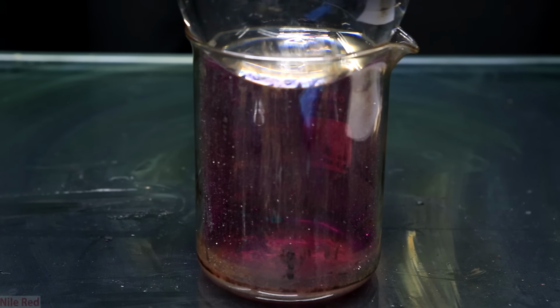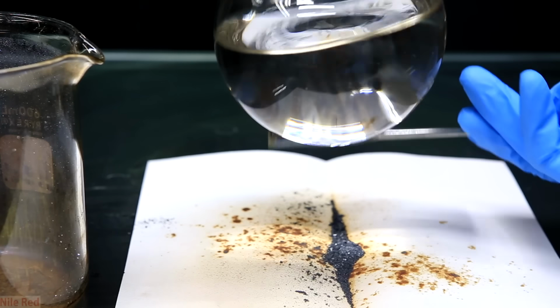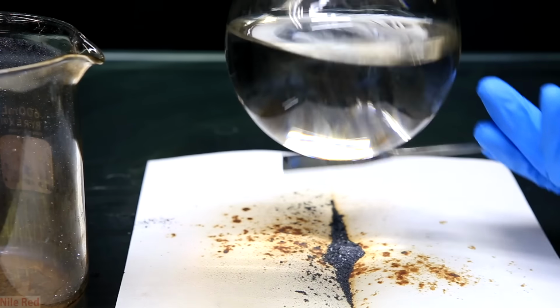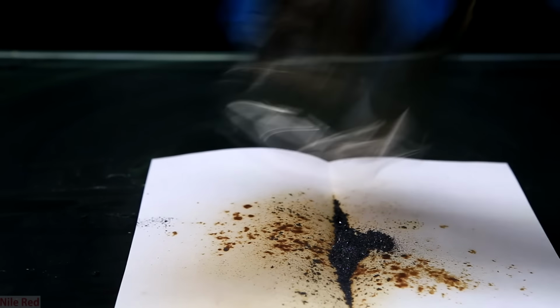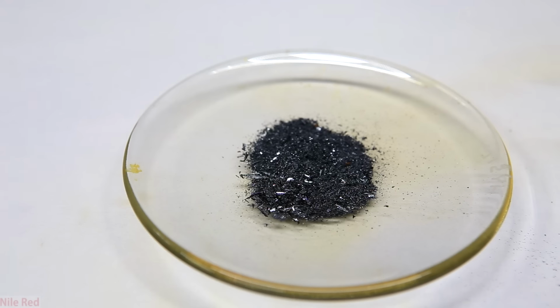We can then start the same process of scraping the crystals off the bottom of the flask, and then taking them out of the beaker. This second process is going to yield a lot less iodine, but it's still worth doing. After all the iodine is scraped off the walls, I add it to the rest. I place the final yield of iodine on a watch glass. The final amount that I collected was around 2 grams.